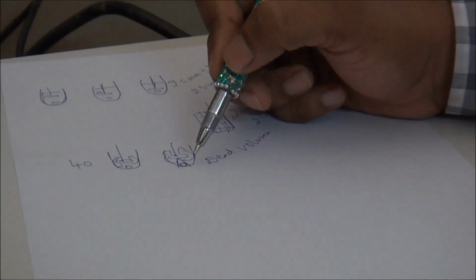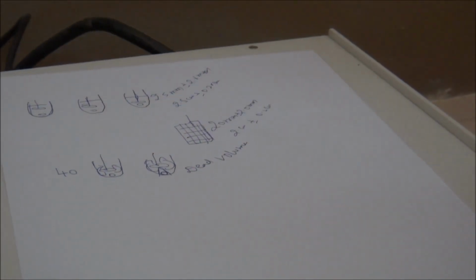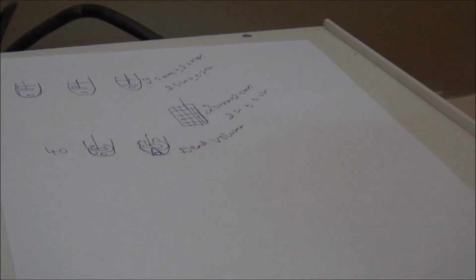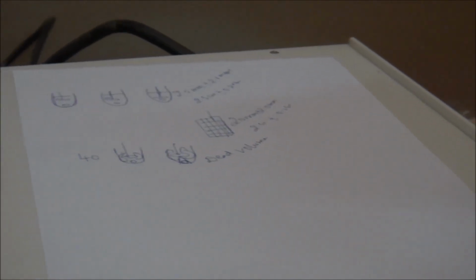When you have a dead volume, the rate of dissolution is going to decrease. So you are not going to interpret the drug release from the tablet as equal to drug release in vivo. The in vitro evaluation is going to be interpreted wrongly because of unawareness of these dead volumes.